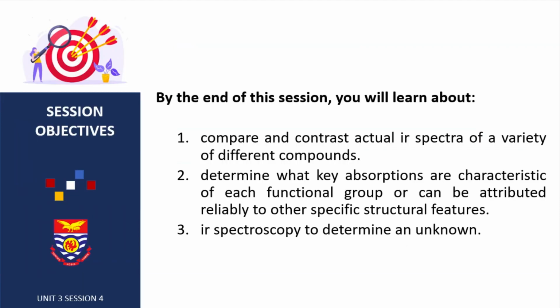At the end of the section, you should be able to compare and contrast actual IR spectra of a variety of different organic compounds. You should be able to determine what key absorptions are characteristic of each functional group and can be attributed reliably to other specific structural features. You should be able to use IR spectroscopy to determine what an unknown compound is.